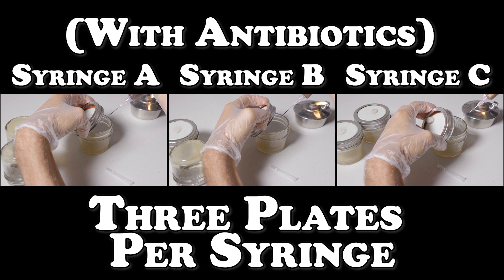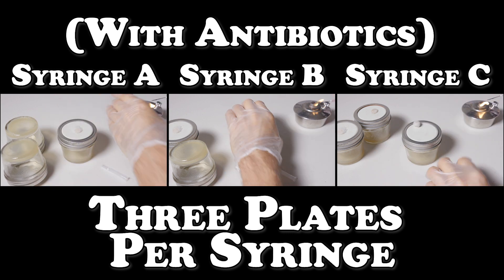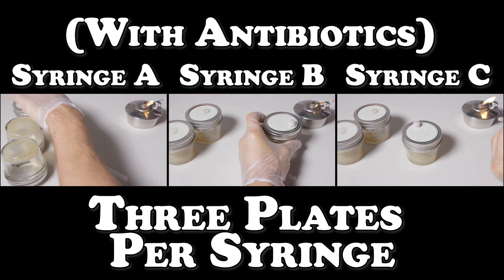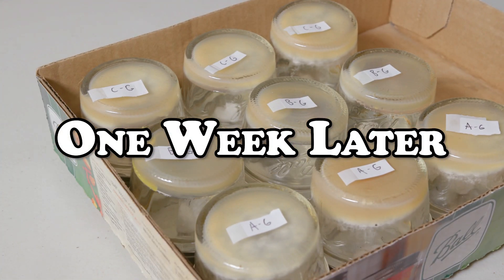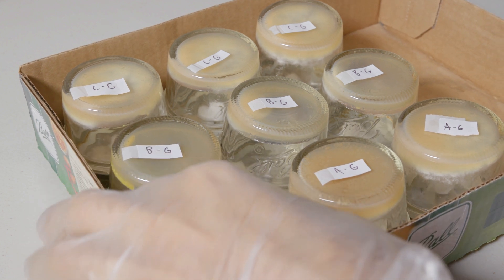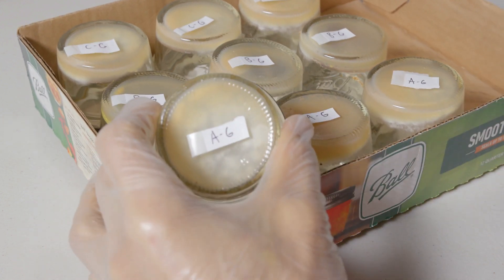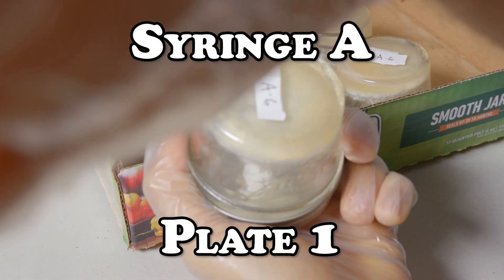As with the regular agar, syringe A, B, and C will each get three antibiotic plates. We will quickly run through each set and see how much difference this simple solution really does make and see firsthand why our antibiotic spawn bags worked so well. Here we are one week after inoculating our antibiotic plates. Notice how I've labeled these plates with a G to denote the gentamicin used in the recipe.